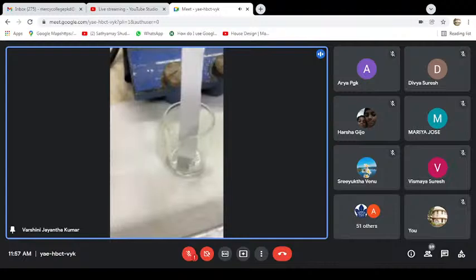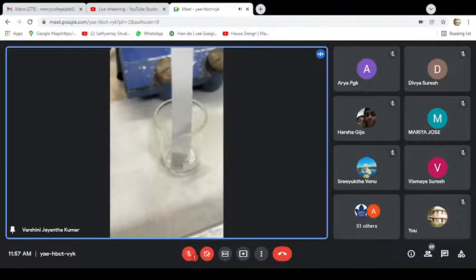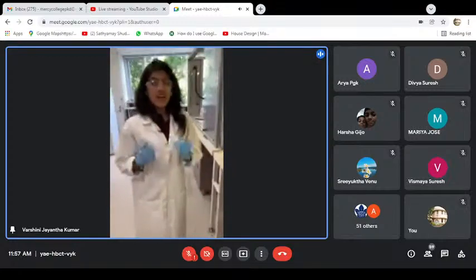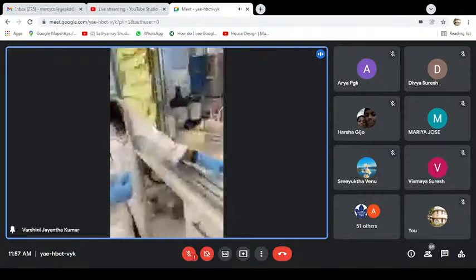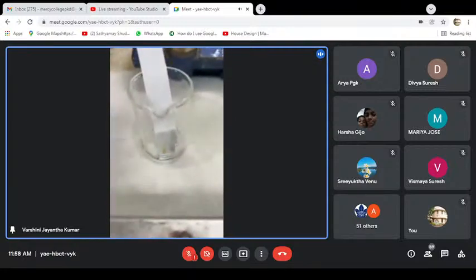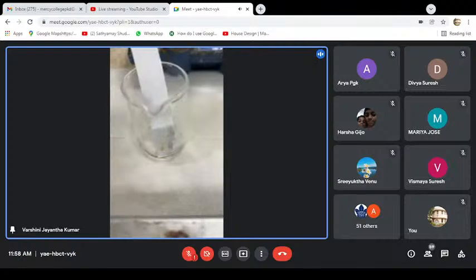So these two compounds are different, right? So it's a starting material and the reacted product. So they have different functionalities and different functional groups. So what happens is that their polarities are different. So they move at different speeds. So one will move fast or one will move slow. Then we can see the separation and we can see whether our compound is actually formed or is it just the starting material. So I'm sure that you will be able to see how the solvent front is moving, carrying the compound with it. So we need to choose a good solvent ratio where the speed of movement of the two compounds are really separable.